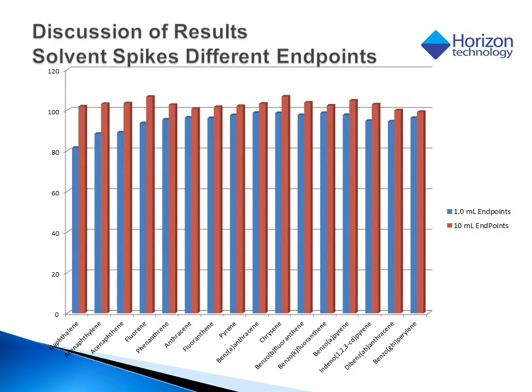The same data set in the previous slide is shown here graphically with these bar slides to make it easier to see the greater deviation on the lower, lighter end compounds.